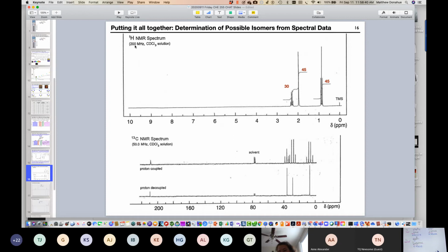So let's look at this proton NMR data, and what I'm going to point out to you now is, see this signal here. Even though there's 1, 2, 3 lines, I'm counting that whole thing as a set. So I have 1, 2, 3 sets.